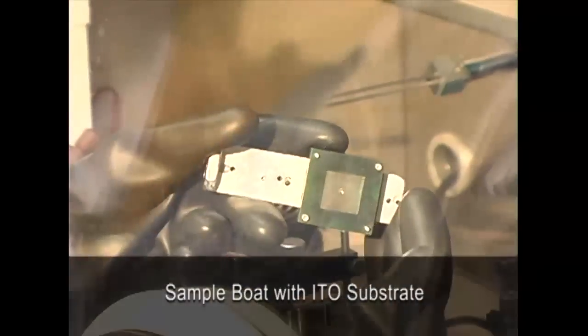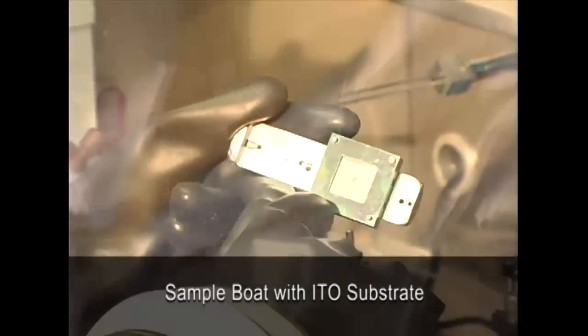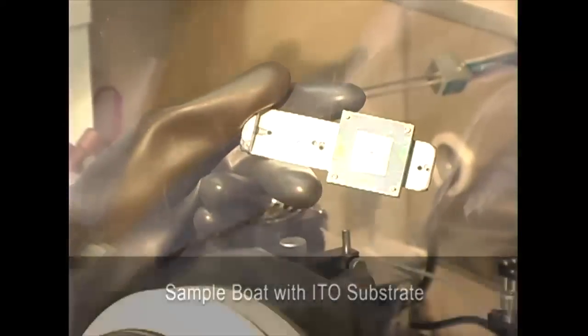The fabrication of a solar cell begins with assembling a sample boat containing glass substrate that has been coated with indium tin oxide. The ITO is electrically conductive and transparent to light.